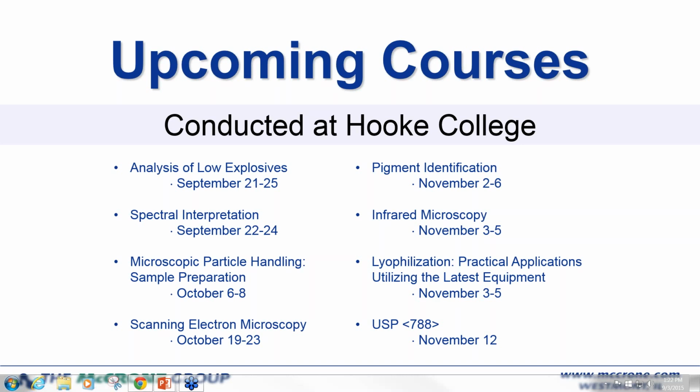For general identification, we have found that IR is better as a general identifier. Raman spectroscopy is less applicable to just generic unknowns. It's great for certain classes of materials, such as pigments, many minerals, carbon compounds such as diamond and graphite. But as a very general identification tool, we like IR. Okay, thanks, Kate.